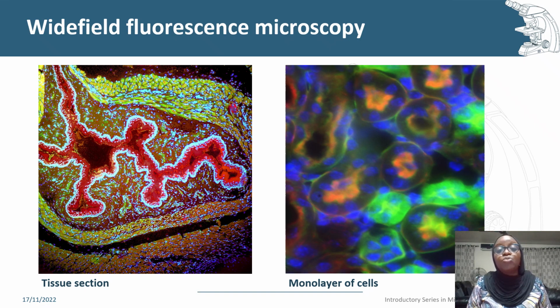What microscope do we need to use to restrict the light to that from only one focal plane? You can slice the sample very thinly, but that can compromise the integrity and is obviously incompatible with live samples.